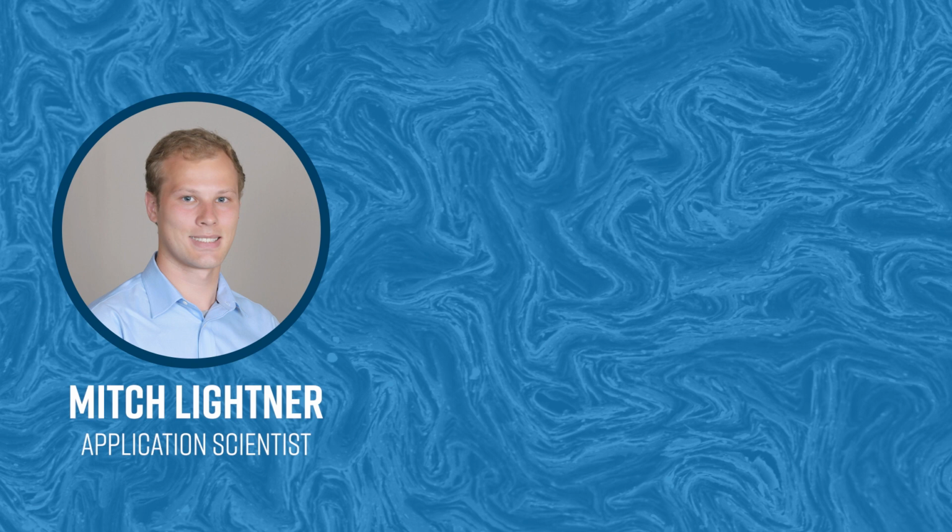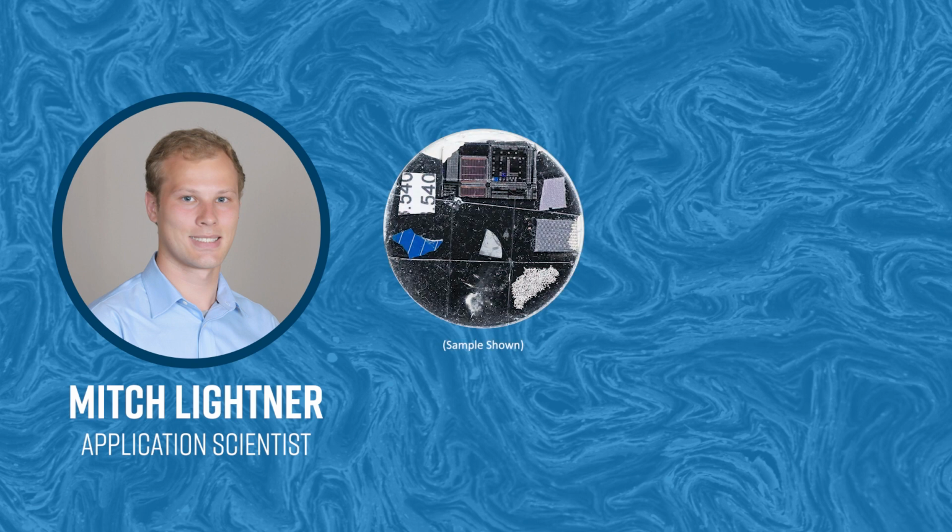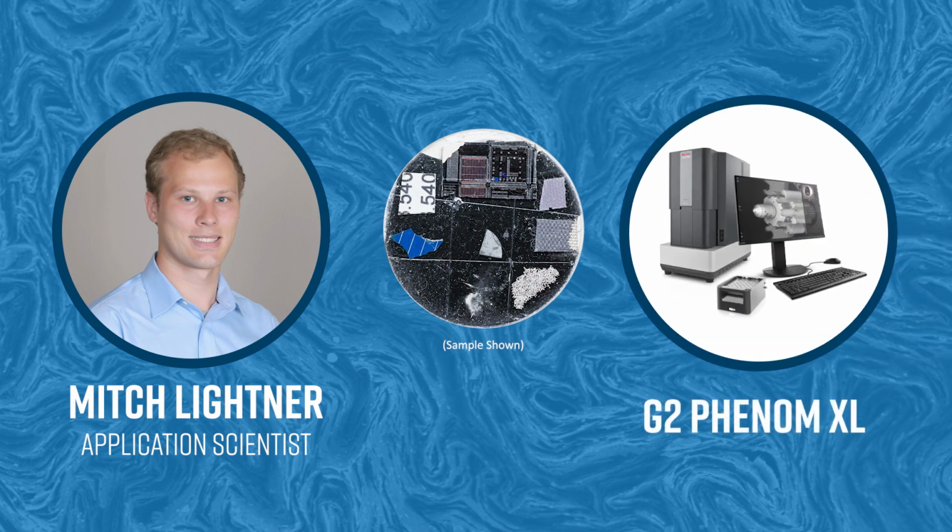Today I will be walking through the different ways to navigate your sample with the Phenom SEM. I will be demonstrating on the G2 Phenom XL, but these methods work on any Phenom SEM.